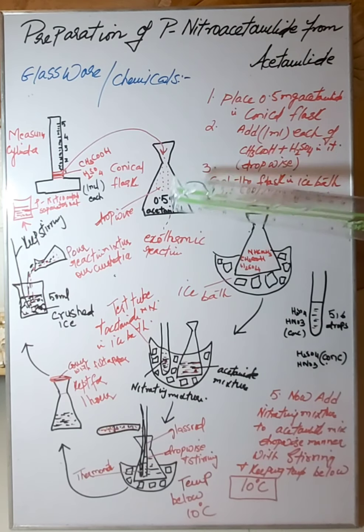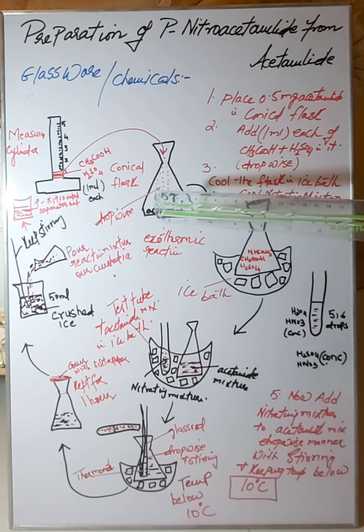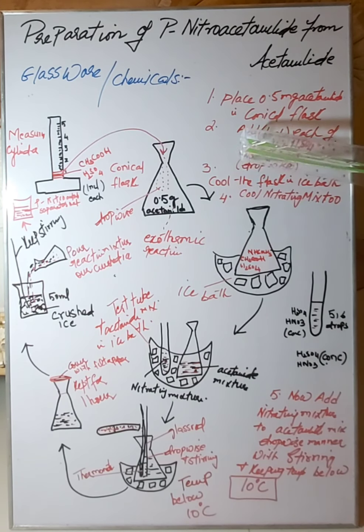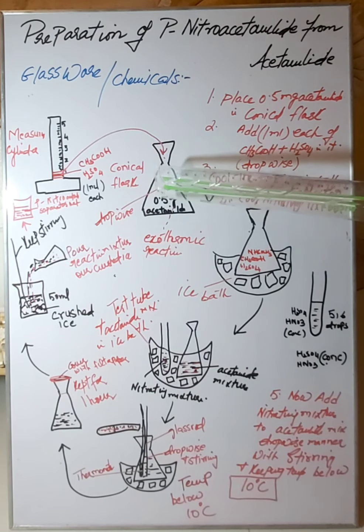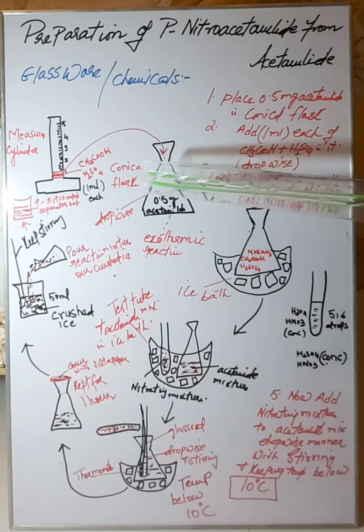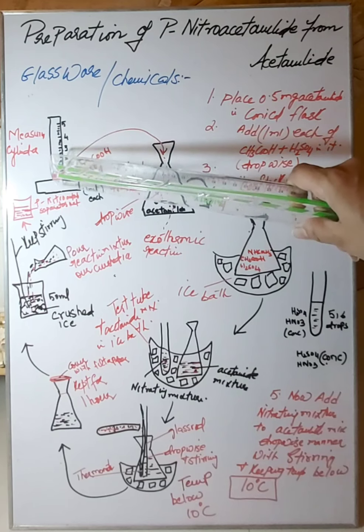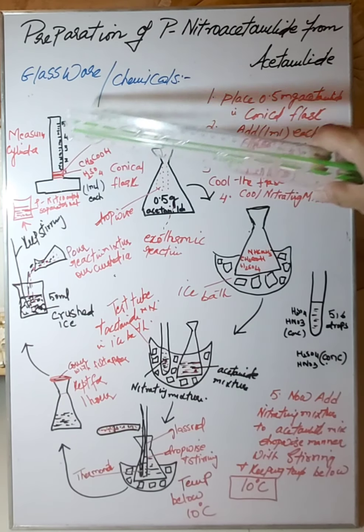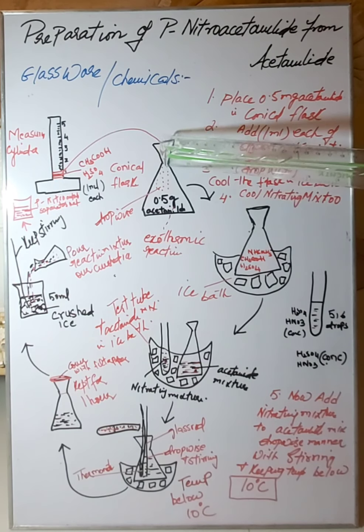So the first step, as I told you, is to put 0.5 gram of acetanilide in a conical flask. Now you have to add 1 ml each of glacial acetic acid and concentrated sulfuric acid dropwise into this acetanilide flask, right? So for that you need to measure 1 ml of sulfuric acid and 1 ml of acetic acid in the measuring cylinder, and then pour that on this acetanilide in a dropwise manner.